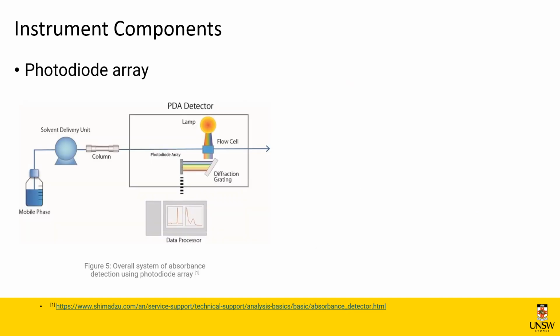The first analysis begins with the solution, now separated, passing through the photodiode array detector, where light is shone through it in a flow cell and then the absorbed light is measured. It is important to note that compounds with good UV or visible light absorbance make for easier detection, as otherwise HPLC-MS cannot provide good detection of the analytes.